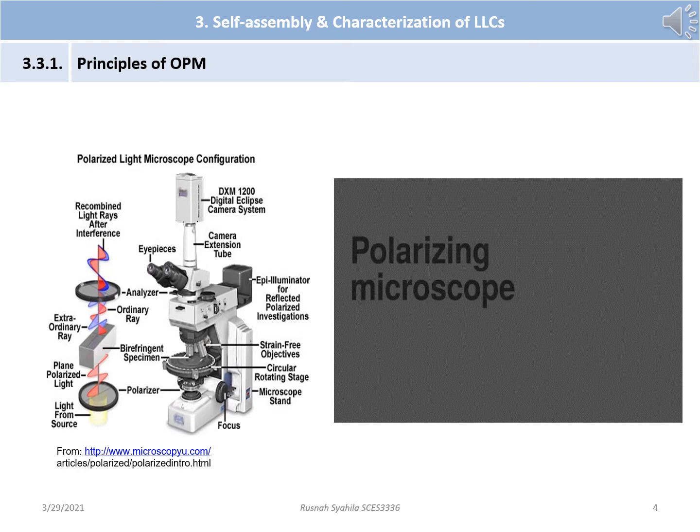This polarized light falls on a doubly refracting specimen, which generates 2 wave components that are at right angles to each other. These 2 waves are called ordinary and extraordinary light rays. The waves pass through the specimen in different phases. They are then combined using constructive and destructive interference by an analyzer. This leads to the final generation of a high contrast image. Please watch the video on the right for a clearer explanation.